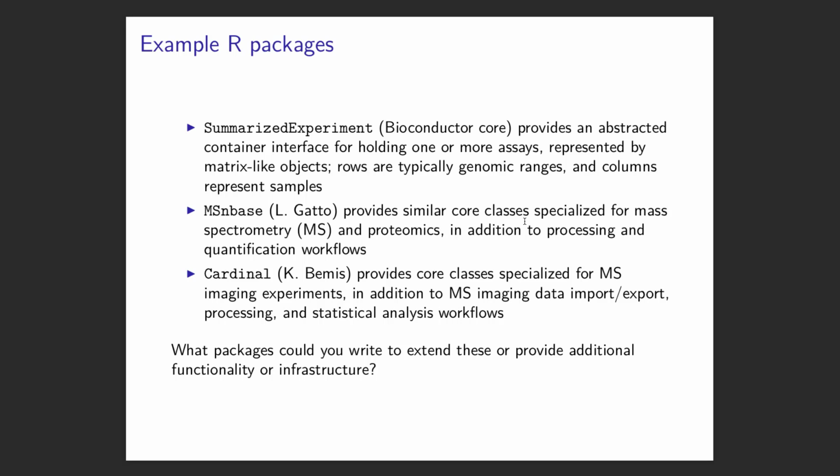Typically, that's going to be genomic ranges for the people who use SummarizedExperiment for genomics, and the columns represent the samples. MSnbase has a similar class called MSnSet and MSnExp for MSnExperiment.